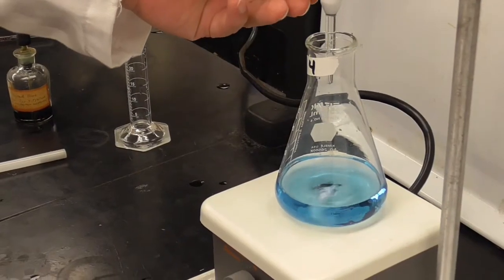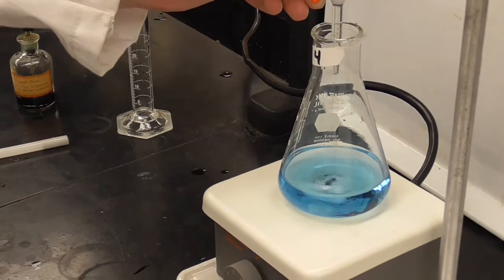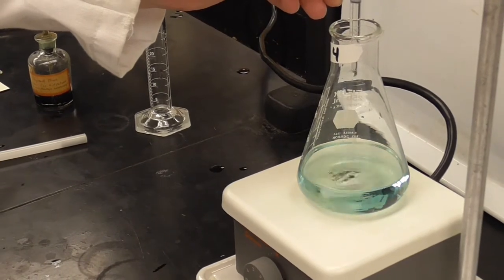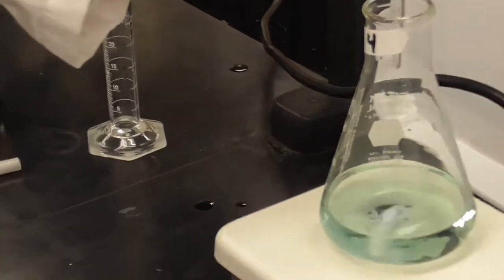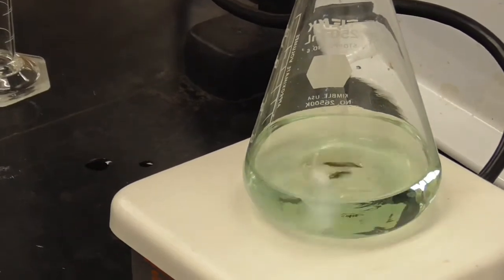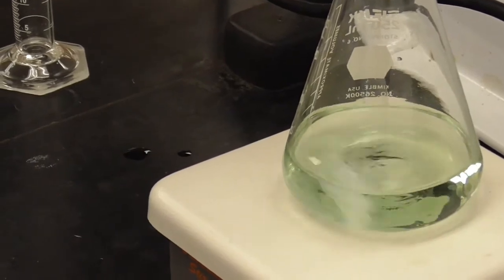Okay, so again, we are getting close to the end point here. I'm not sure how much we've got for the end point. And, okay, he's got drop, drop, drop. And, okay, so green. Still kind of greenish. Still green.